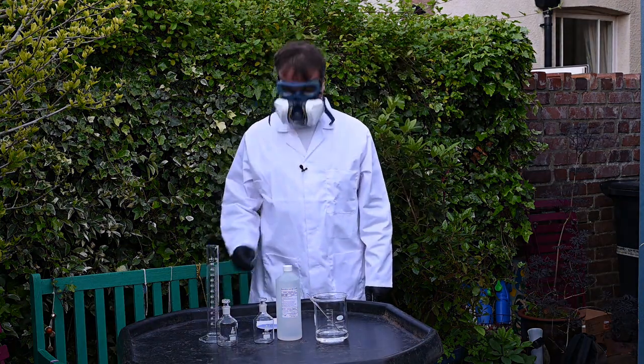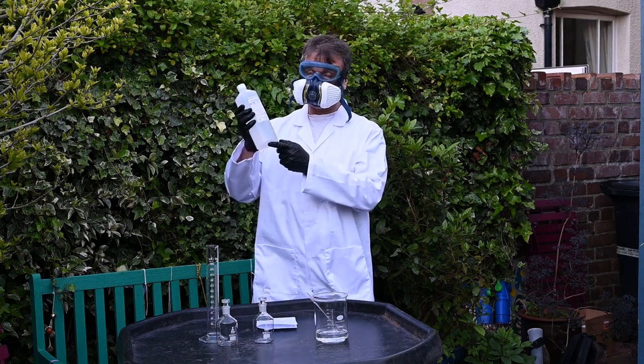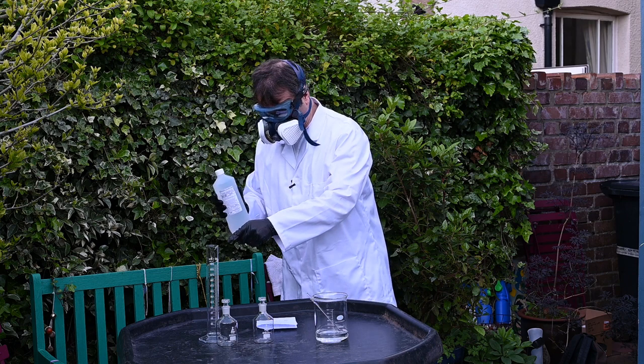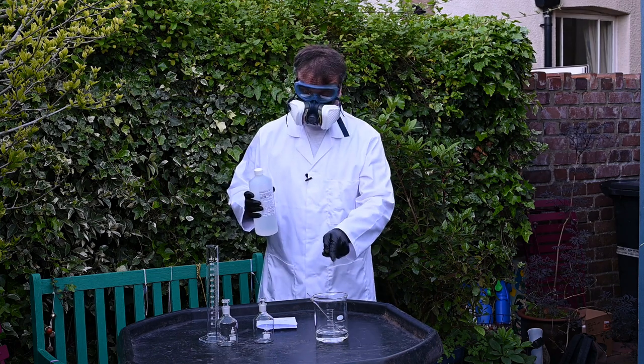Now for the dangerous bit: we're going to put 43 millilitres of concentrated hydrochloric acid into this measuring cylinder and then pour it into the water.